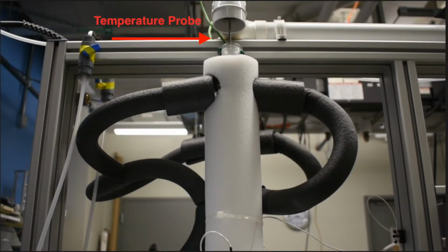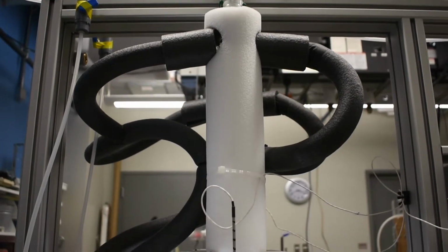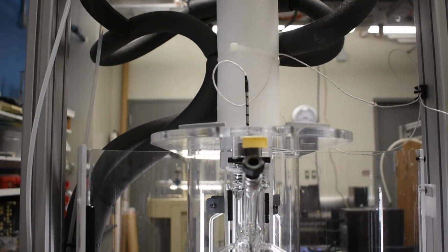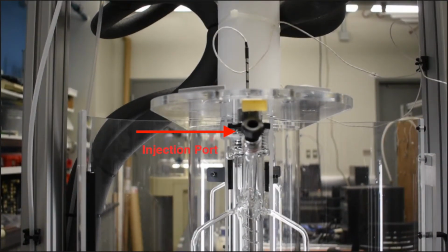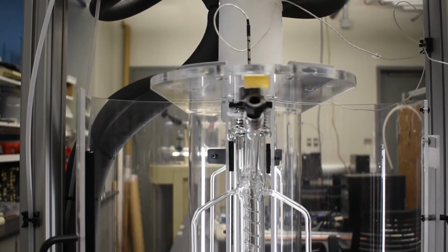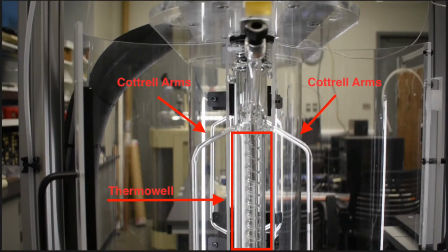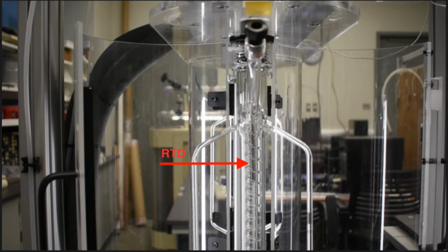You will also see a temperature probe above the condenser. The temperature recorded here is to ensure that the condenser is properly functioning and that hot vapors are not being released into the lab. Next, you see the injection port. This is where the solvent and solute are injected using syringes. Moving down, you'll see the thermal well and the Cottrell arms. It is in this region that the vapor-liquid equilibrium occurs. The resistive temperature detector sits inside the thermal well.